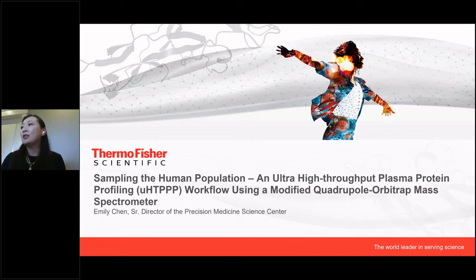I'm the Senior Director of the Thermo Fisher Precision Medicine Science Center. Today, I will switch gears and talk about the concept of a complete workflow solution, not just about protein numbers. I'll introduce the Thermo Fisher large-scale plasma protein profiling workflow in collaboration with Evosep, a very nice group of people we have been working with in the past couple of years, and also the workflow on our newest Orbitrap Exploris 240 mass spectrometer for plasma biomarker discovery.